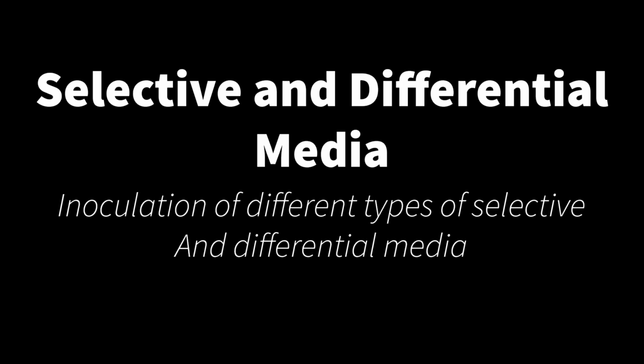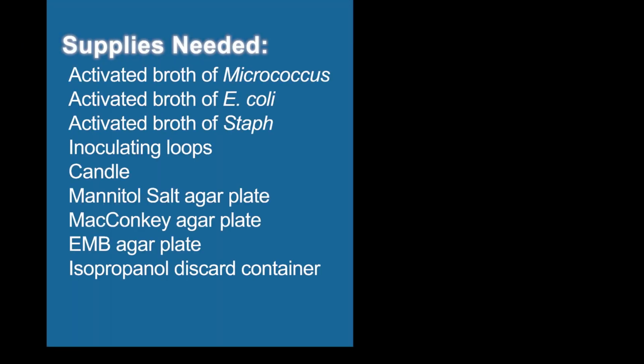This video is to show the procedure for the selective and differential media lab that you will be performing as one of the activities from your Carolina biological kit you received. Before you begin, make sure you have these necessary supplies.